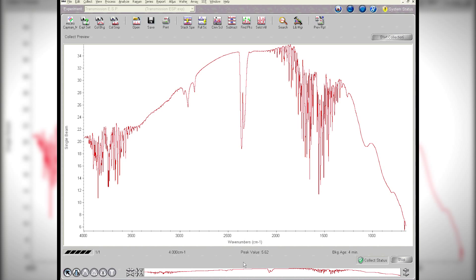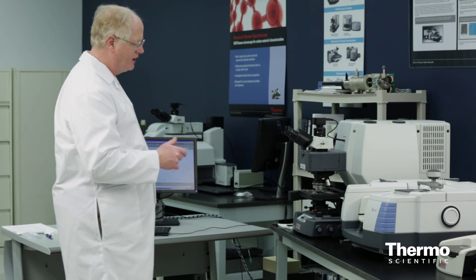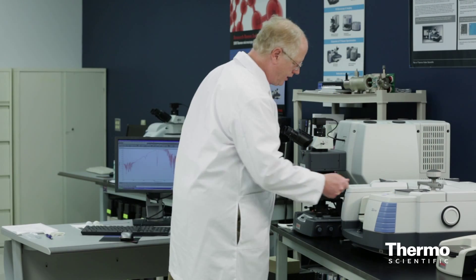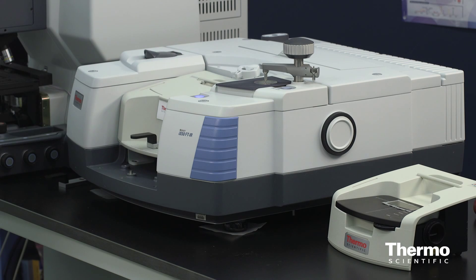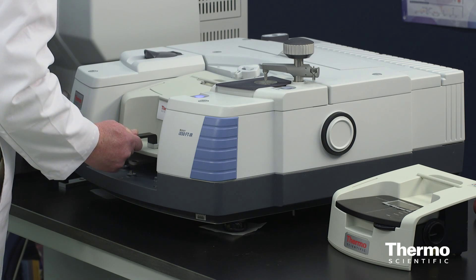So this is our background. It's in preview mode, so you can see it's collecting one scan. In order to start it we'll tell it to go ahead and collect, so now it's collecting the data. As soon as it's done collecting, I will push the shuttle all the way in, which will place the sample into the IR beam.